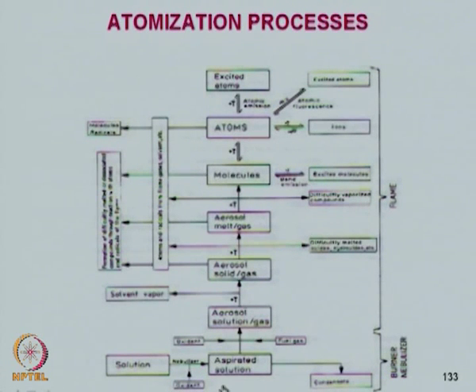First of all you start aspirating the solution here, and the aspirated solution gives you small droplets and bigger droplets. Smaller droplets get carried into the nebulizer, and it forms an aerosol.